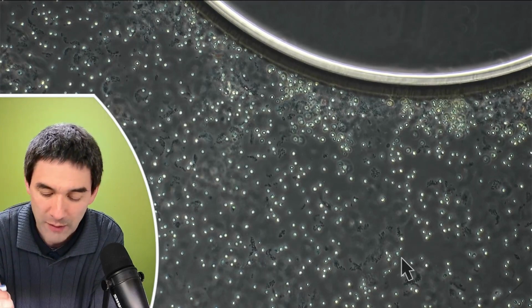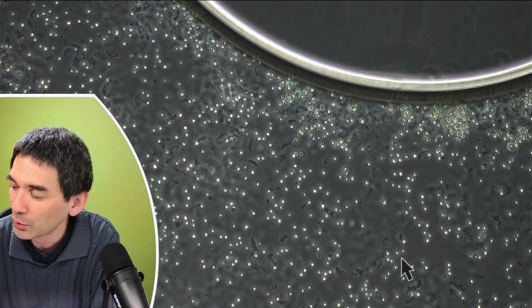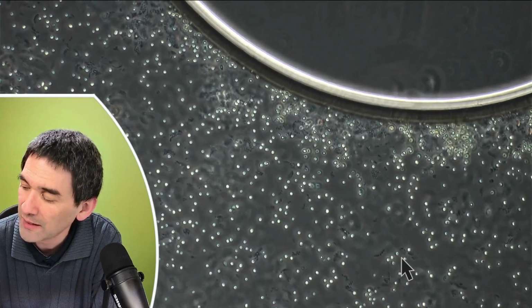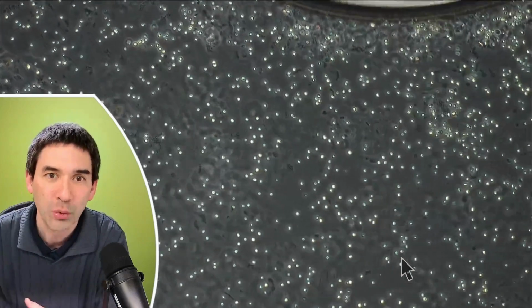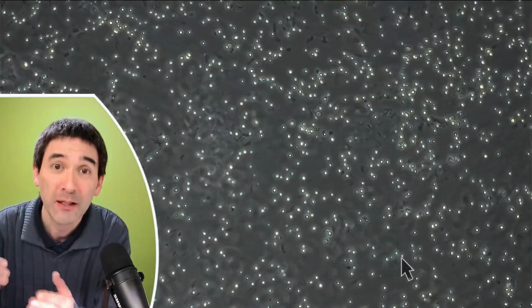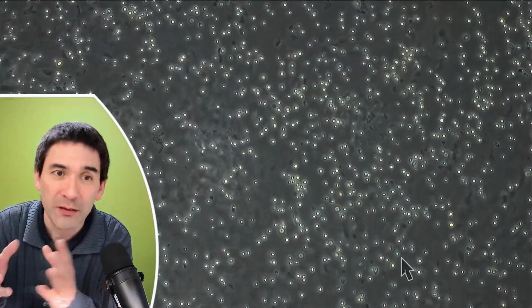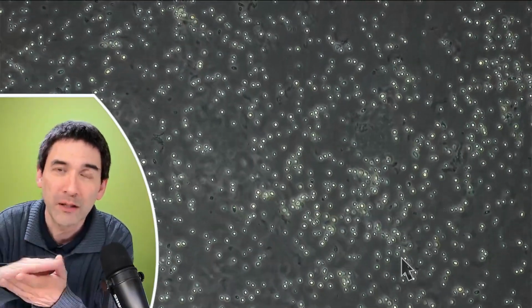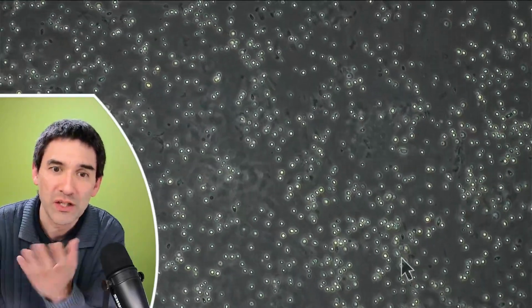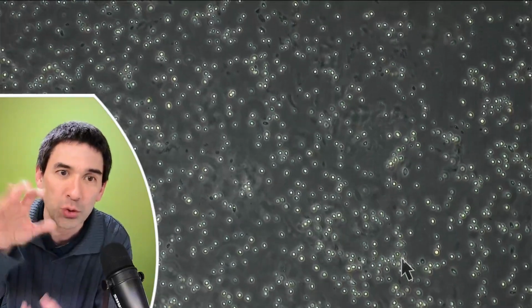So I'm just going to grab a little bit of liquid here from my jar, and I'm going to add it now to the corner of the cover glass, and let's see when it is soaked in by capillary action. Right? Then the liquid spreads beneath the cover glass on the microscope slide, and you see, of course, that those particles, those cells, also move, depending a little bit on the capillary movement of the water. Maybe there are some air bubbles that are kind of collapsing. So you see it's a little bit directional, but you see that the vibration of the Brownian motion is superimposed.